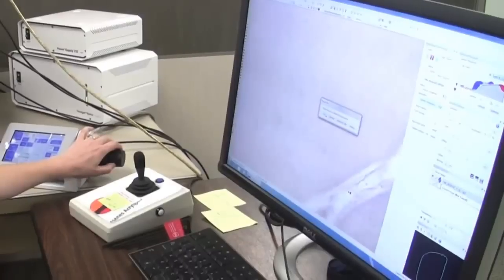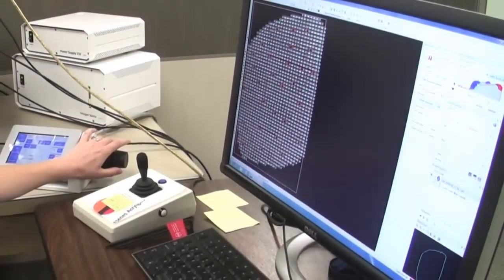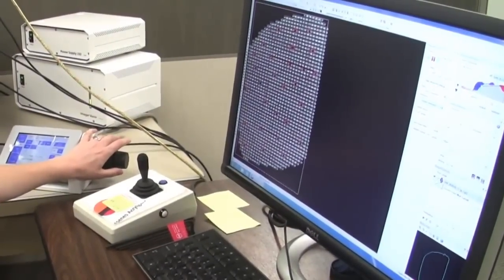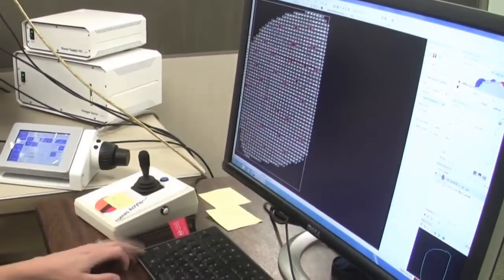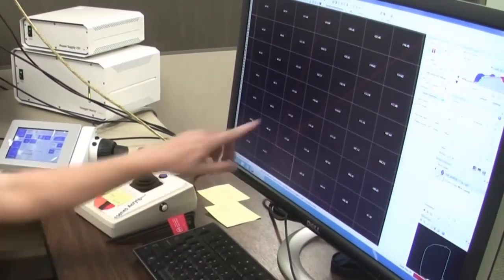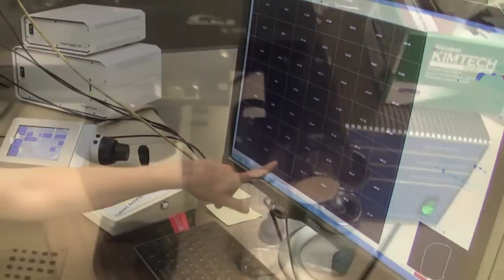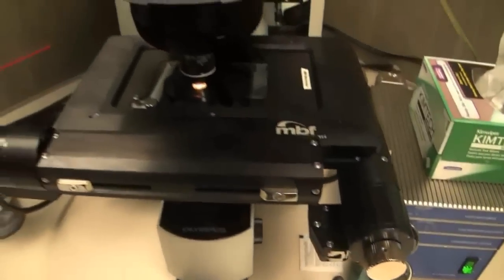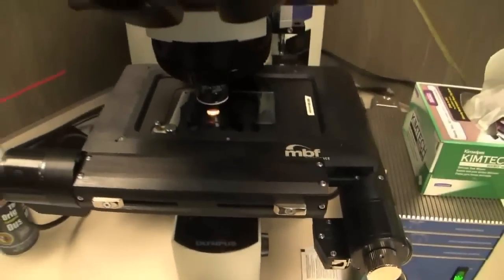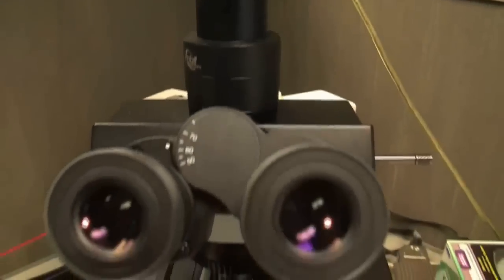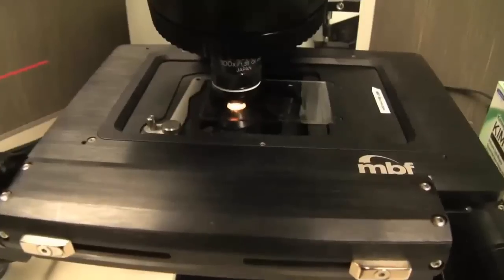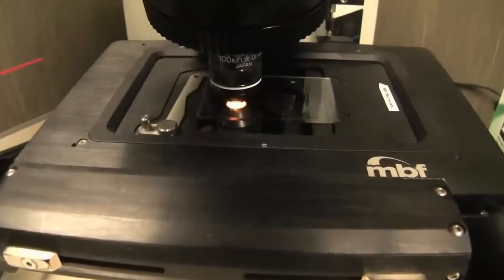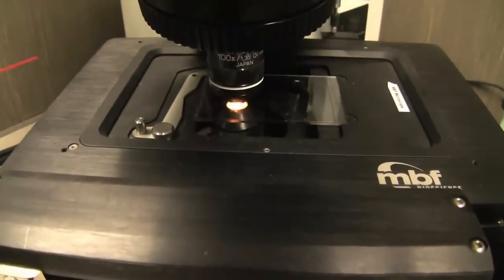Unlike any other stereology software on the market, StereoInvestigator seamlessly integrates with all of the major microscope vendors: Zeiss, Nikon, Olympus, and Leica. StereoInvestigator also supports confocal and 2-photon microscopes from these vendors and allows full control of structured illumination solutions, such as the Zeiss Apotome.